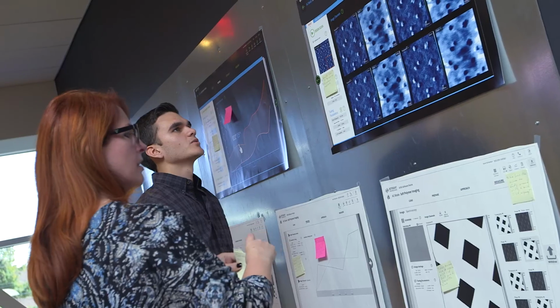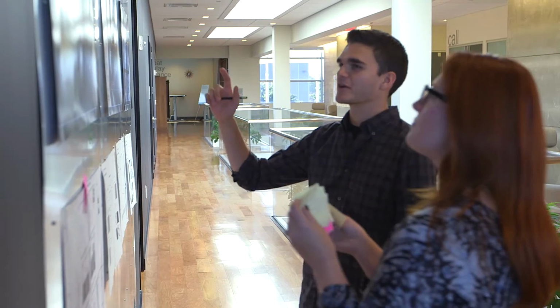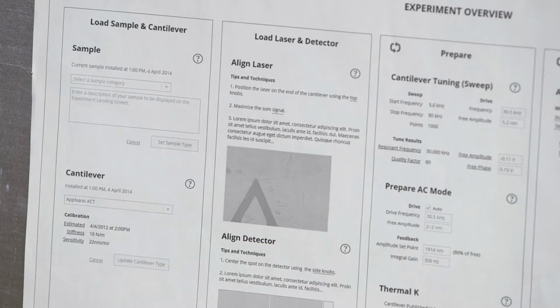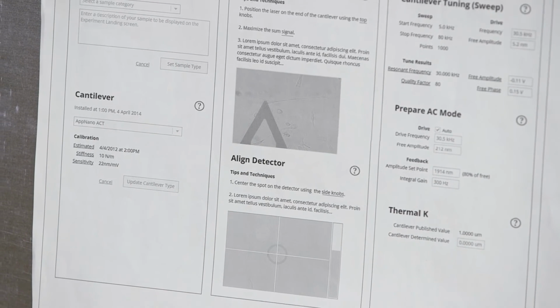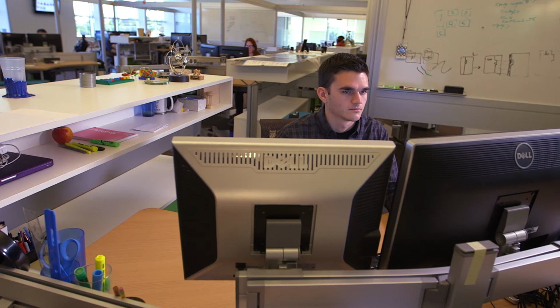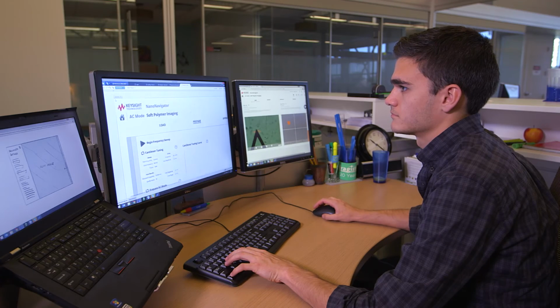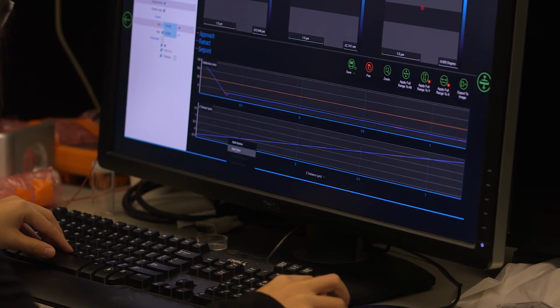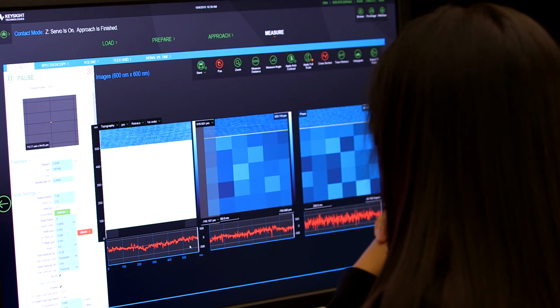Once we had agreement on the information architecture and the primary interaction models, we created a detailed wireframe prototype that let us explore how users would complete typical tasks sitting at the monitor and from across the room, as well as how our design matched their needs. After 2 rounds of validation, we were able to create the final visual designs and be confident that we had exceeded the expectations not only of our client, but also of their users.